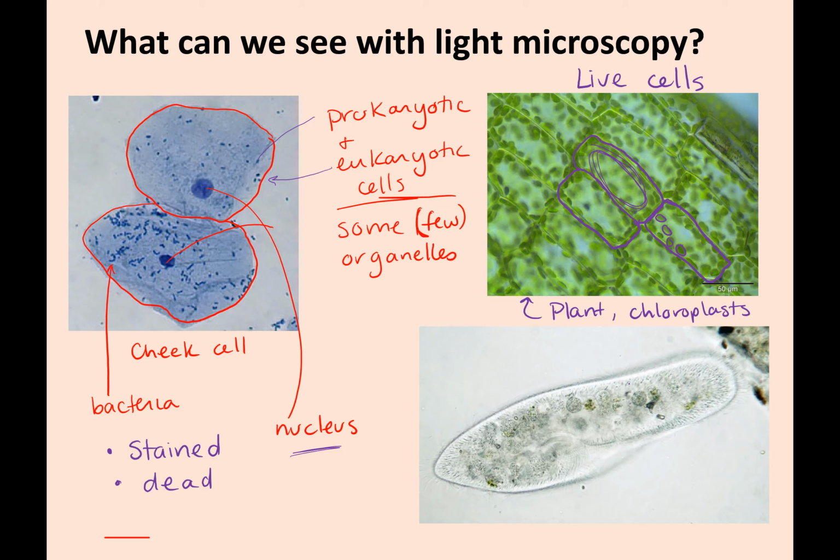The bottom picture here is a paramecium. It is not an animal cell like your cheek cell, and not a plant cell, but a protist. This is another group in the eukaryotes. It's another family? Kingdom? I don't remember all my taxonomy.